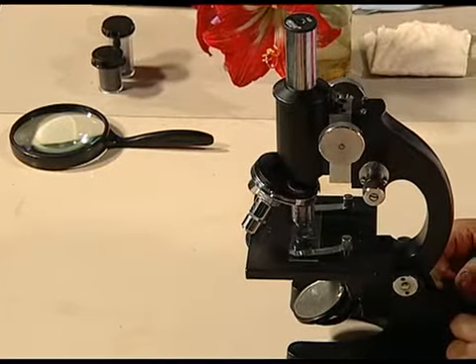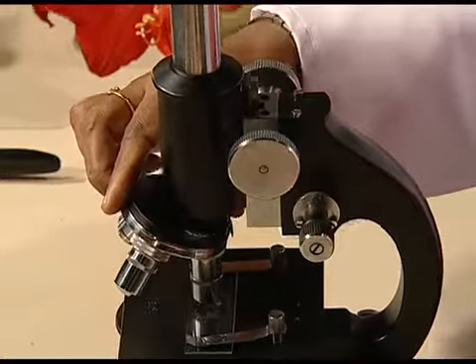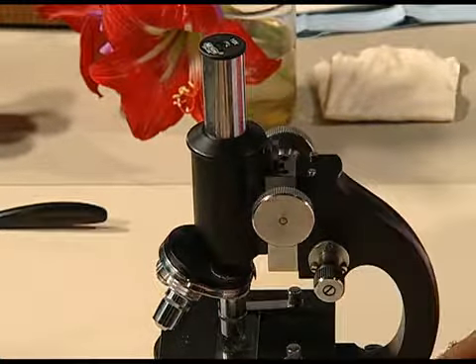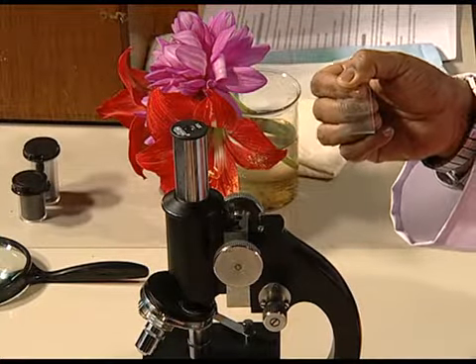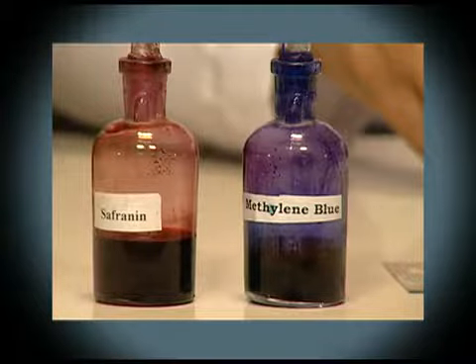As told earlier, if you had focused the object well with the low power lens itself, you would have to use only the fine adjustment. This temporary slide of pollen grains has been prepared with the help of glycerin. But sometimes we can also use stains in order to see the object or its details more clearly.